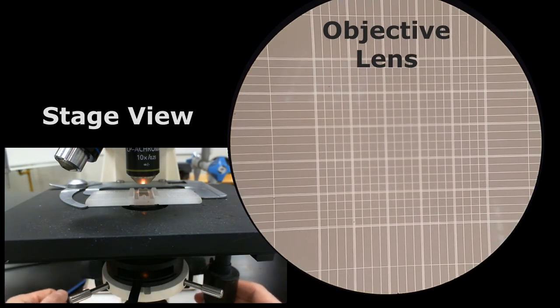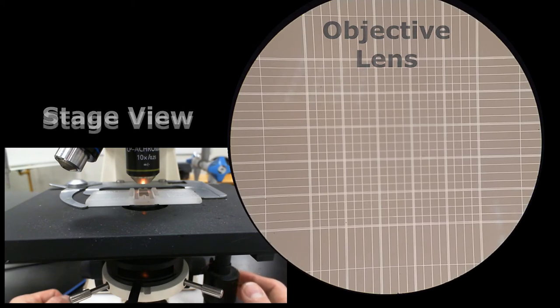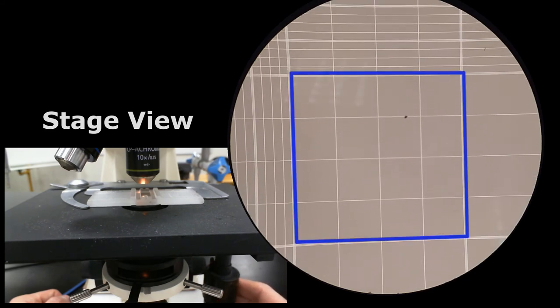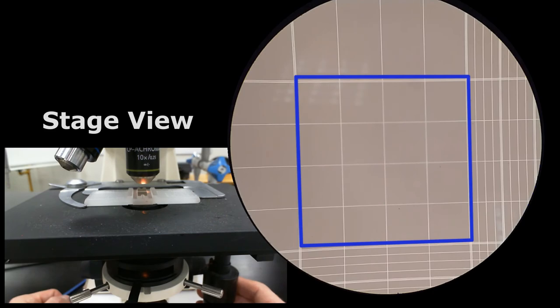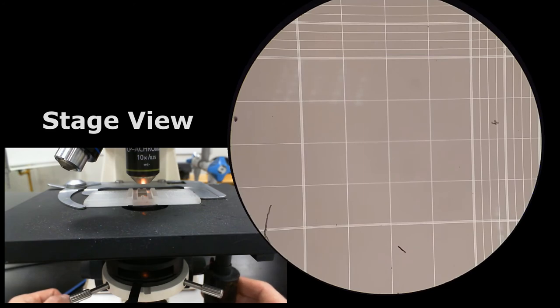Unfortunately, I don't have a smaller or lower power lens to show you the whole thing, so we're only going to be looking at this at 10x magnification. This is the middle portion of the counting chamber. We're going to be counting this large square here. You will also be counting the cells in this large square here, this large square here, and this large square here. And that'll be 5 squares.